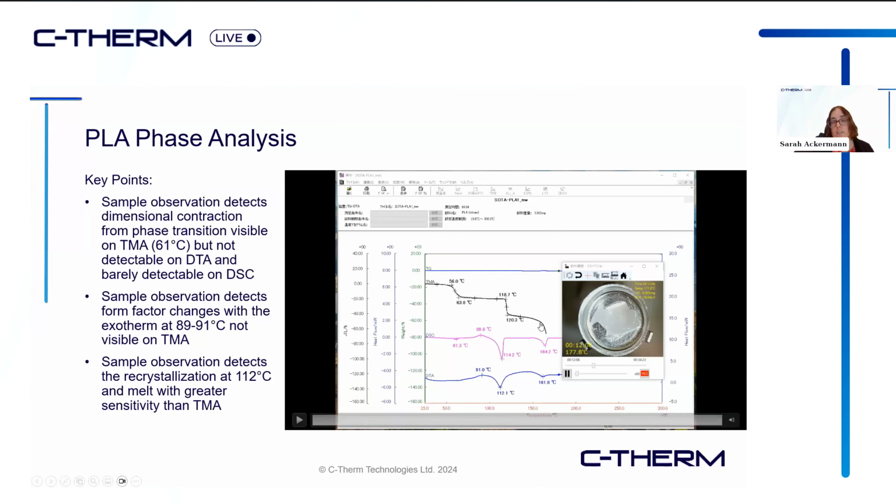And finally, of course, we can observe the sample through the melt after the TMA has to stop, because the TMA system has a meltdown protection, so it won't let the sample melt on into it. So we can observe as the sample becomes less viscous as we get further into that liquid phase, and it will begin to contract within itself.